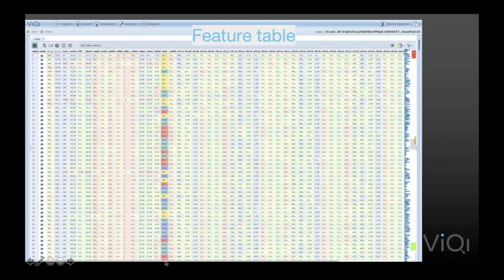And this is called different things. Typically, either the class or the label is also sometimes used as the name for this. This is your target. What are you training the AI to do? You're training it to predict the class, right? And because this is supervised learning, to do the training, you're giving it which set of columns for a given row correspond to a particular class that you've labeled, right? And so those together are given to the AI.